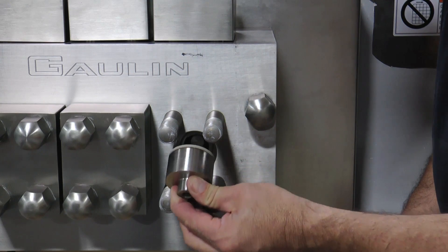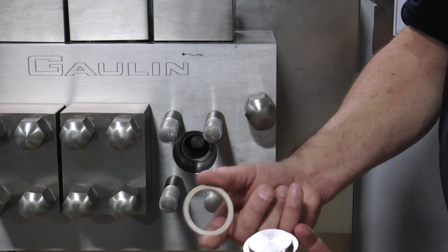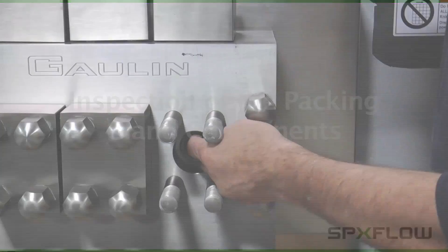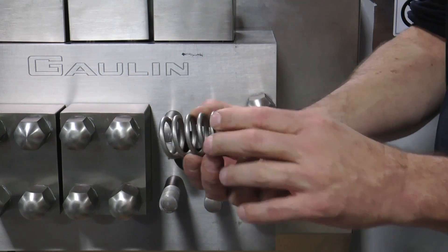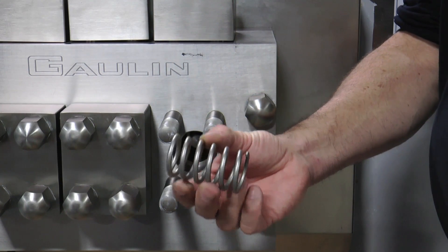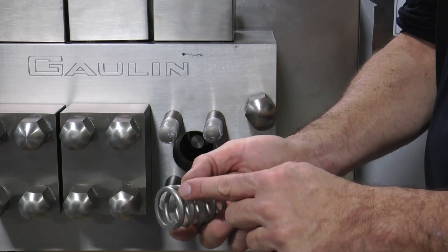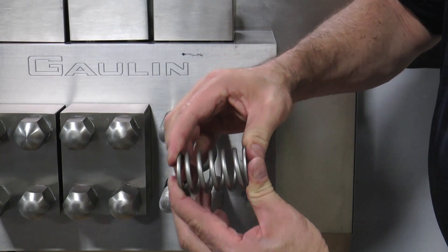Remove the liquid cylinder head and inspect the gasket to make sure it does not contain any rough edges or pitting. Check the spring for signs of wear. Springs need to be replaced periodically. Place the spring on its end on a flat surface and compare its height to a new spring. If there is a height difference, the spring will need to be replaced.